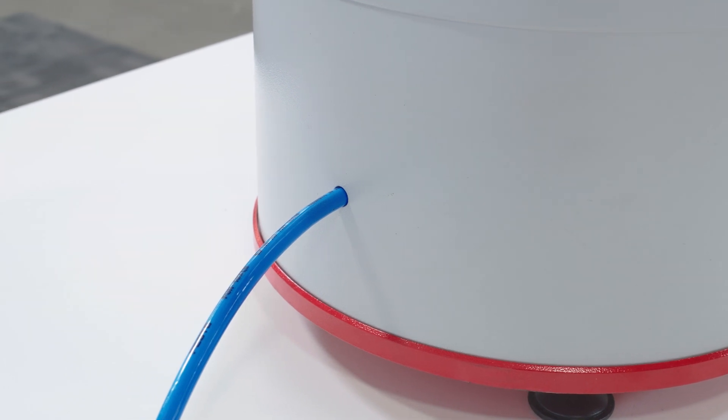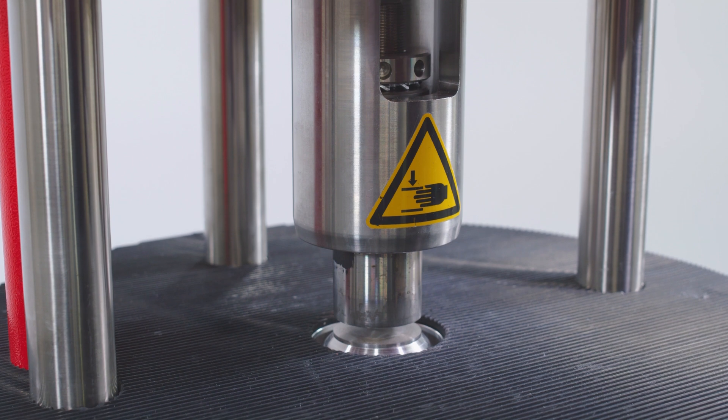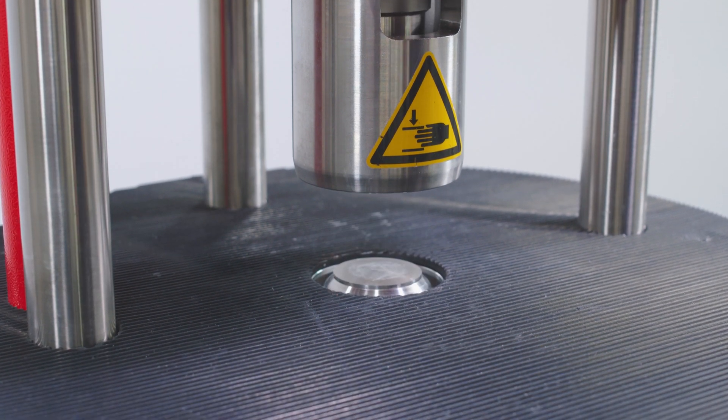It has a wireless cutting system, meaning the compression piston and blade never come in contact with one another, so the cutting blade stays sharp and lasts longer.